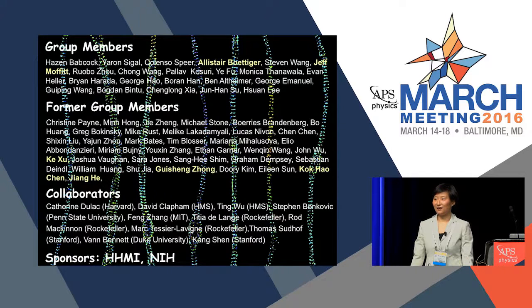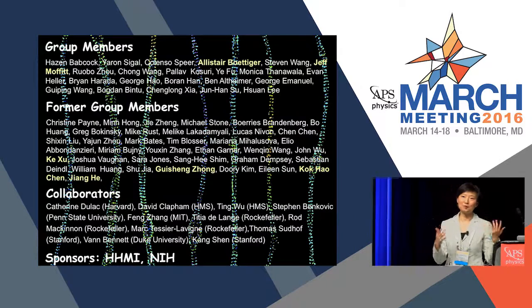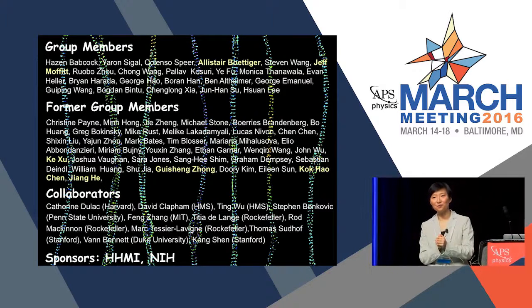You can find collaborators, you can ask us, and we can show you maybe how to do the imaging. Better yet, you probably even have local collaborators, because STORM is a pretty widely adopted method that many labs are using now. And there's also a commercial machine doing that, so you can buy a commercial machine and then do this kind of super resolution imaging. Thank you.